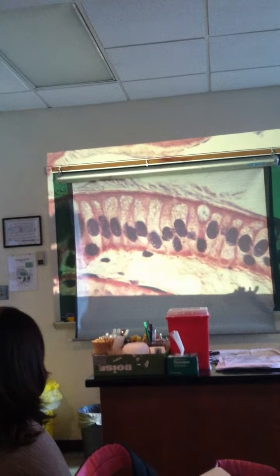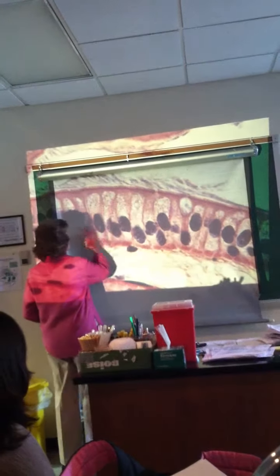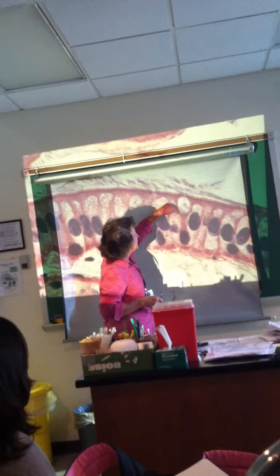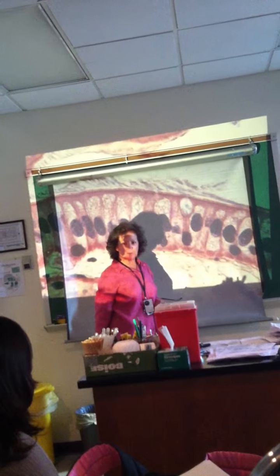They're very subtle microvilli. Now, you go, well, what is happening here? All of a sudden, the nuclei are in a row, but then we get a little wiggle here. Well, what is the name of this cell? With that teardrop of mucus in the top. Goblet cell. So what is that organelle? Vacuole. What is the stuff in it? Mucus. So it spits mucus droplets to keep your digestive tract lubricated.